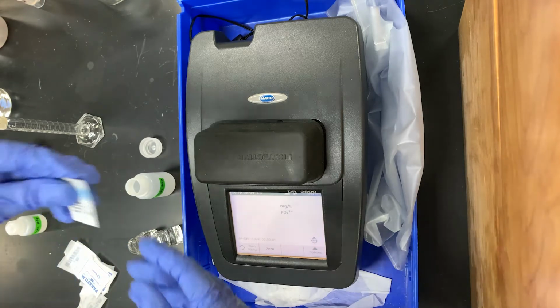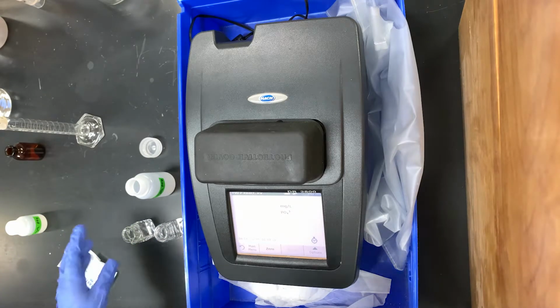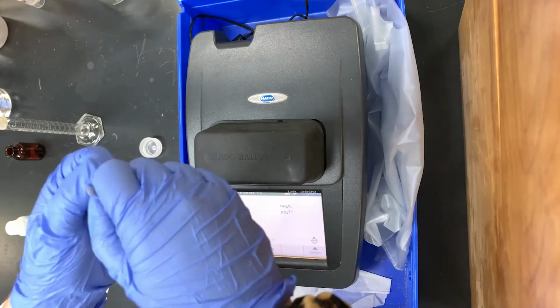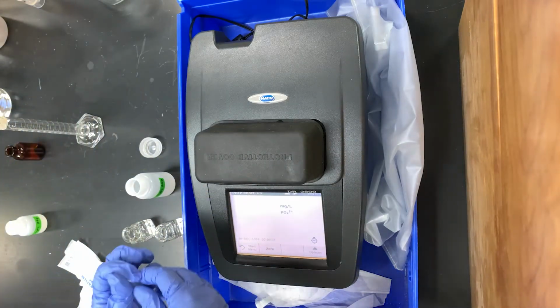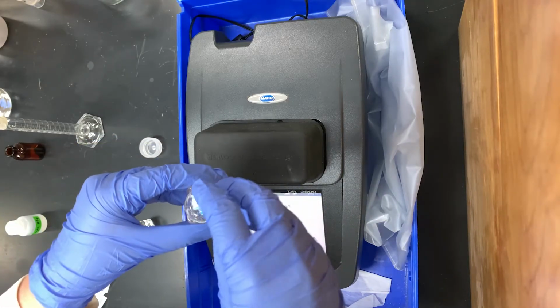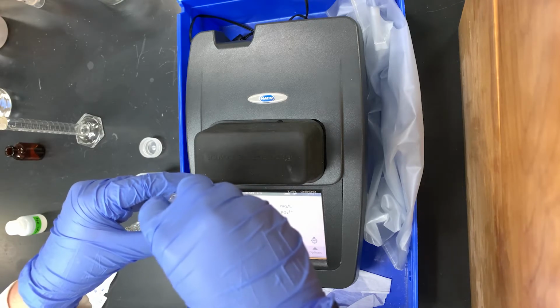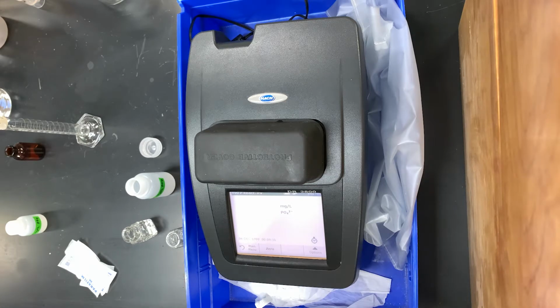So how this technique works is we add our powder reagent into one of our cuvettes, and the other cuvette is just plain sample, which will act as the blank. We will open this pack up, and usually you do this in the fume hood to avoid getting the powder everywhere, and always make sure to wear safety goggles when using these packets. We'll add the whole packet into one of these cuvettes. We'll add a piece of parafilm on top and give it a good shake for 20 to 30 seconds.